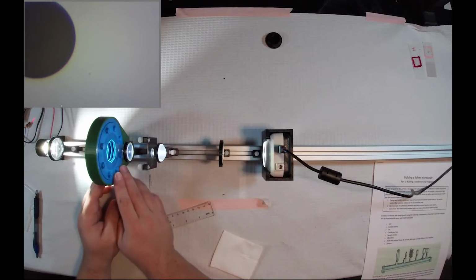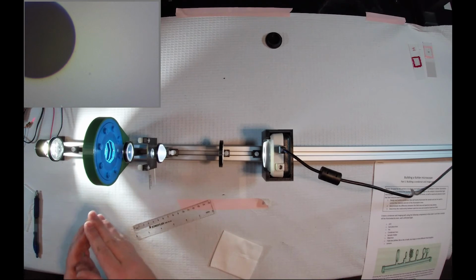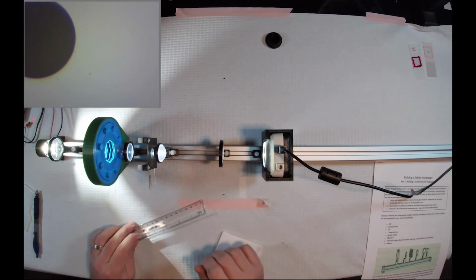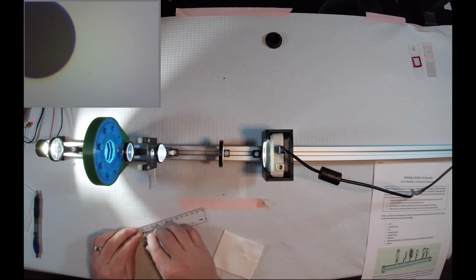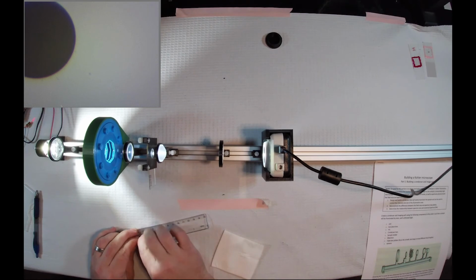So when this is fully open, I'm no longer restricting the amount of light that is maximally incident on our condenser. So then you don't need to include the iris in this second calculation at all. You should simply be able to think about, okay, what is the diameter of this lens? Again, it's going to be 28 millimeters.